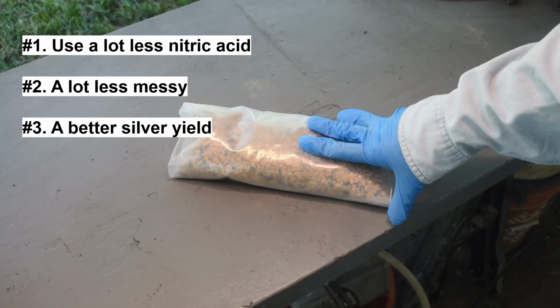Now it's a little bit apples and oranges because it's not the exact same mix of tantalum capacitors here. Last time it was about 50-50 black and yellow with some other colors mixed in. This time it's almost all yellow with 10 to 20% black and nothing else. So I wouldn't expect exactly identical results, but if I do significantly better than 1%, I'll call that a win. So those are my three main criteria for how I'm going to judge this as working better.